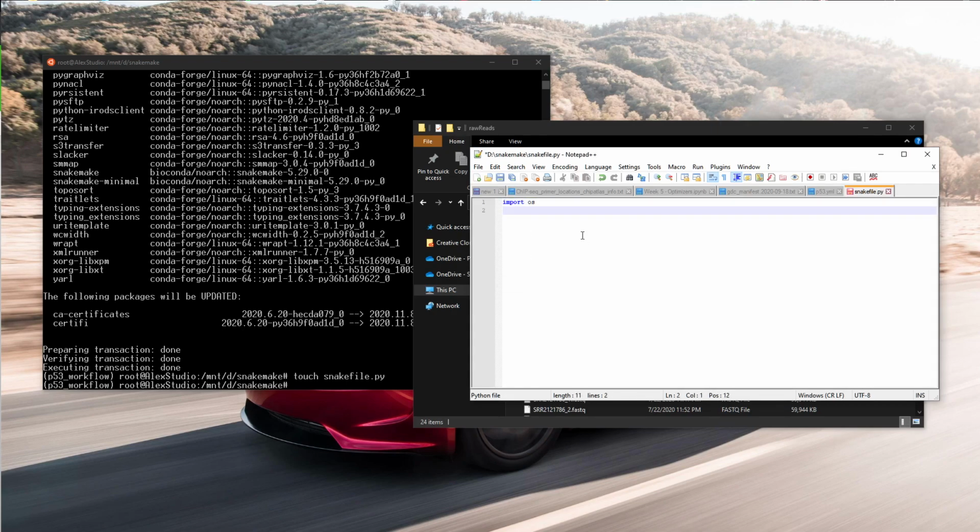We also have to import glob. Those allow us to reach out into the folder and identify things. Glob also allows us to use wildcards, what Snakemake calls wildcards. You specify a variable and it'll automatically detect.